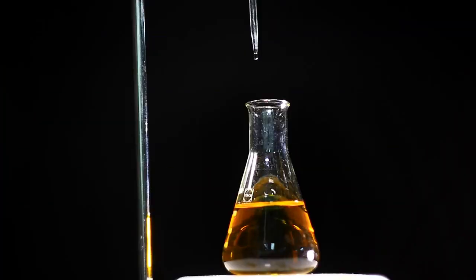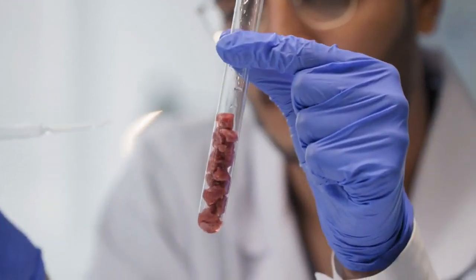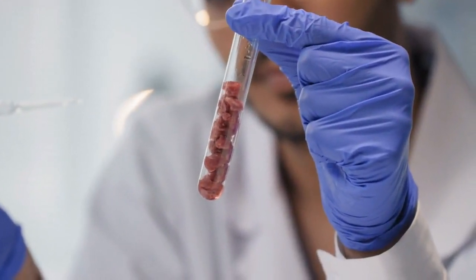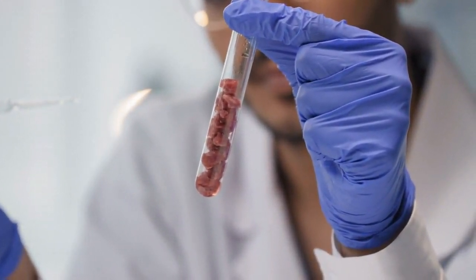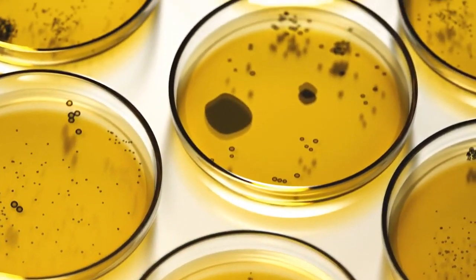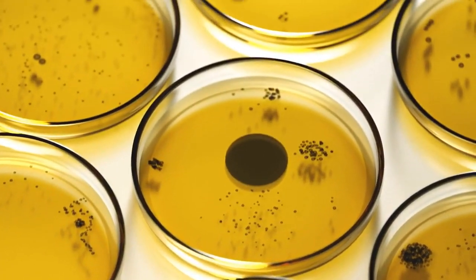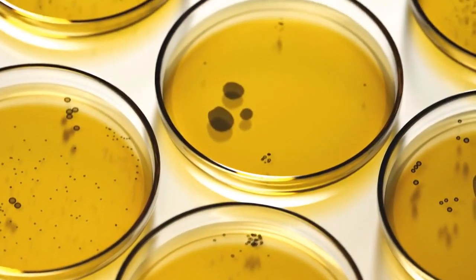Burette. A long, graduated tube with a stopcock at the bottom, used for precise measurement and dispensing of liquid volumes in titration experiments. Petri dish. A shallow, cylindrical, transparent dish with a lid, used for culturing microorganisms and observing small samples.